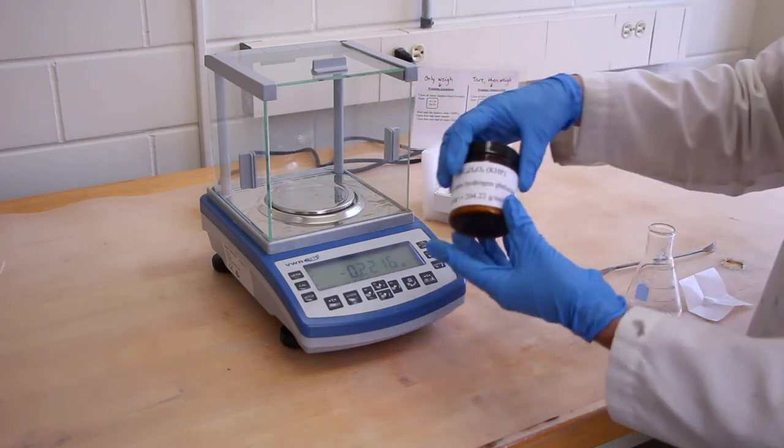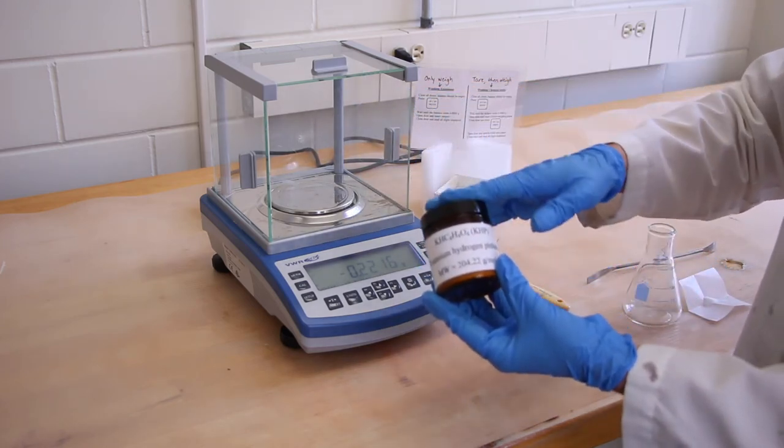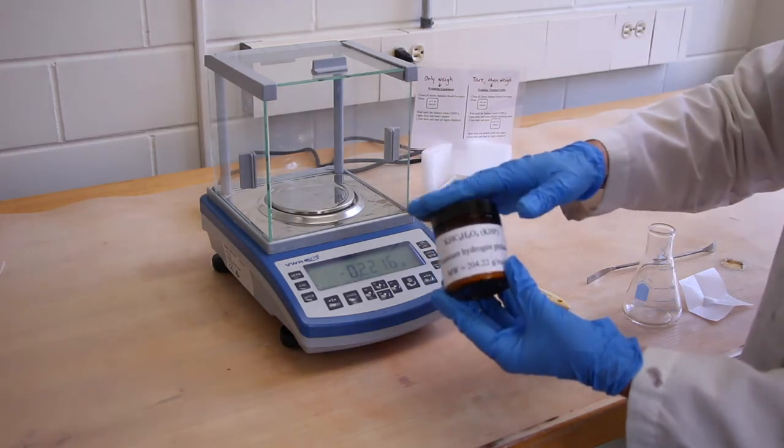Be sure, when you're done, to cap all containers that you have used.